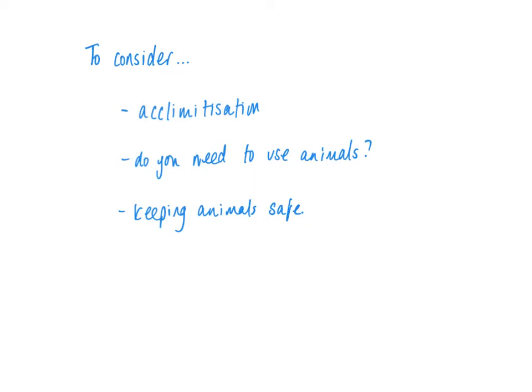When doing an experiment using this sort of thing, it is really important to consider a few factors. So you must consider acclimatization. Basically, you set up your equipment, and if you're using living things, you need to give them a period of time to adjust to the new conditions. So they need to have 10 to 15 minutes to get used to being in the equipment.